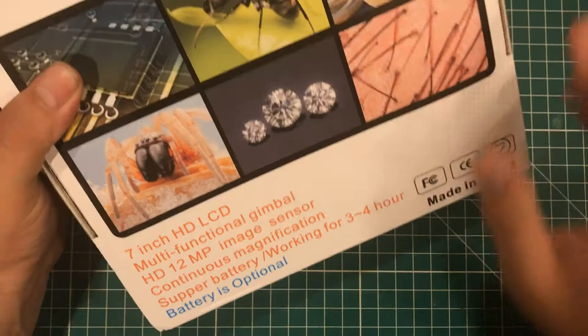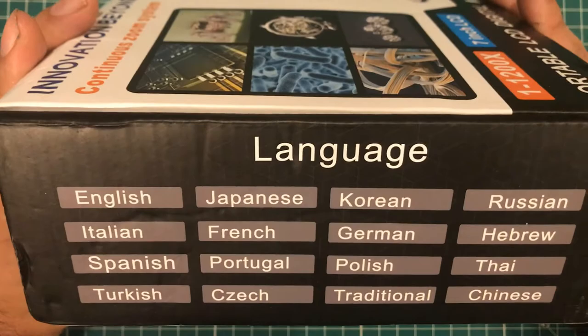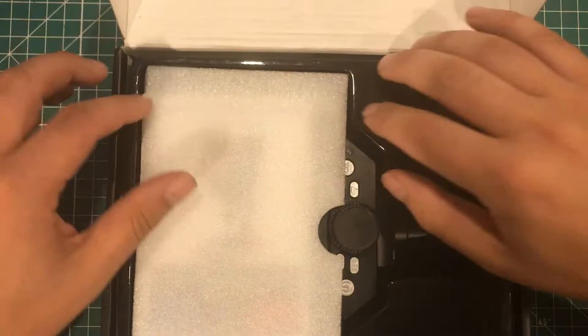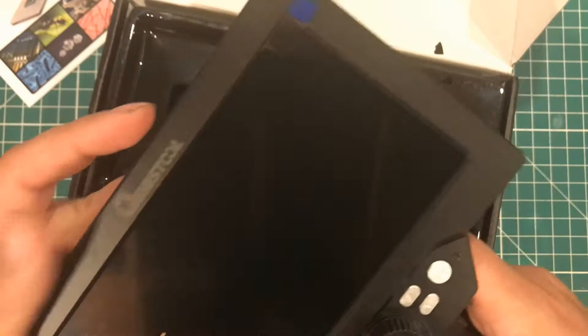Battery is optional, that's interesting. It works for three to four hours on battery. And it works in Hebrew, so that's sweet. Let's open it up. We have a little crack in the package, but the thing itself is looking good. The portable LCD microscope, user manual, and wow — it's a Must Tool. I reviewed a Must Tool meter, it's actually in my toolbox right now. I forgot this was Must Tool.